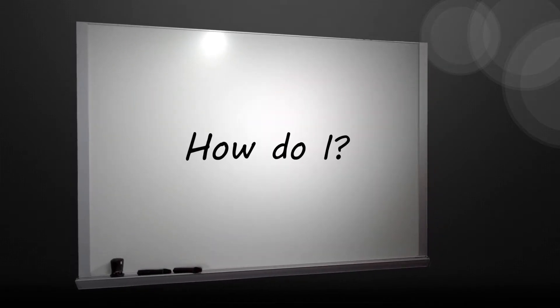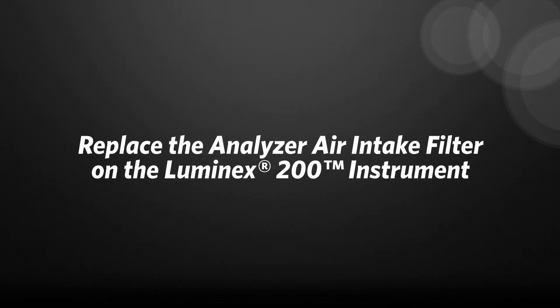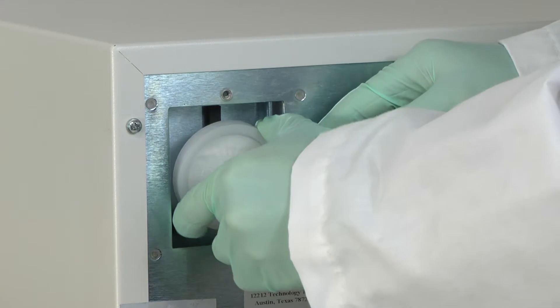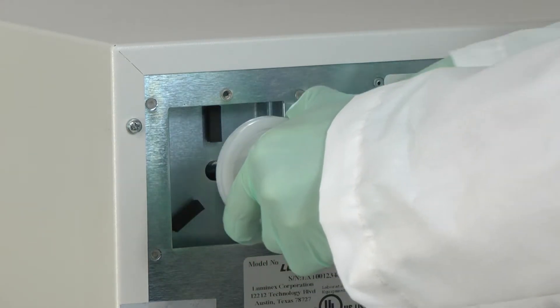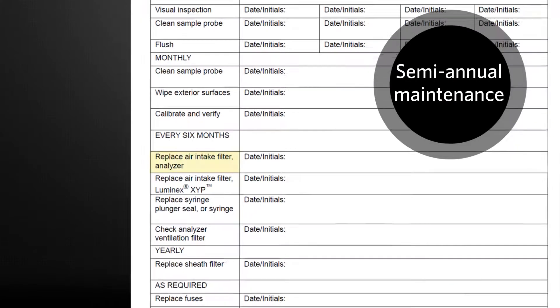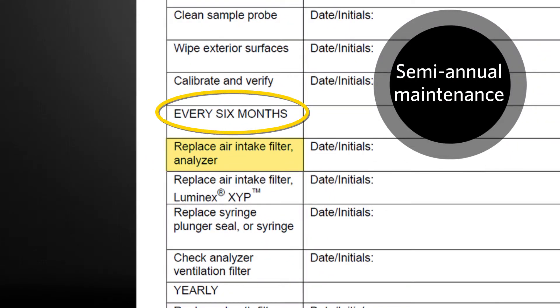How do I replace the analyzer air intake filter on the Luminex 200 instrument? Let's go over the procedure for removing and replacing the analyzer air intake filter on the Luminex 200 instrument. The intake filter needs to be replaced every 6 months.